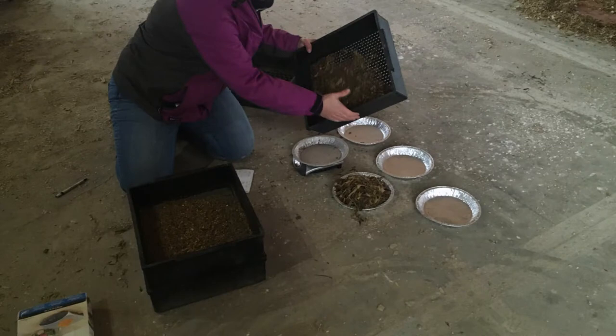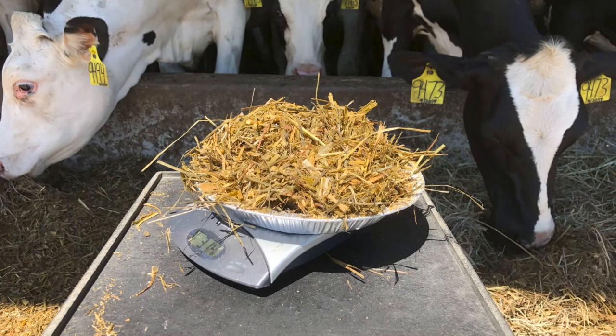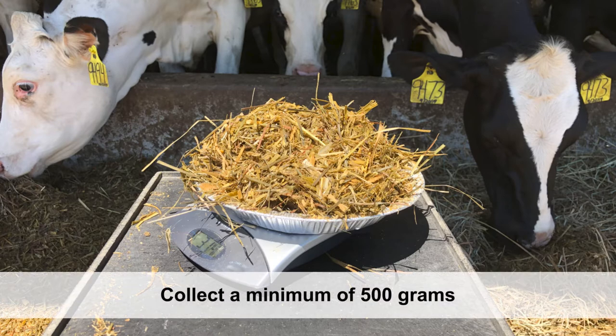With so many valuable uses, it is important to understand how to properly use this device to analyze a feed or forage sample. For proper analysis, collect a fresh sample that cows have not had the chance to eat or sort through. Using a scale, collect a minimum of 500 grams of feed.